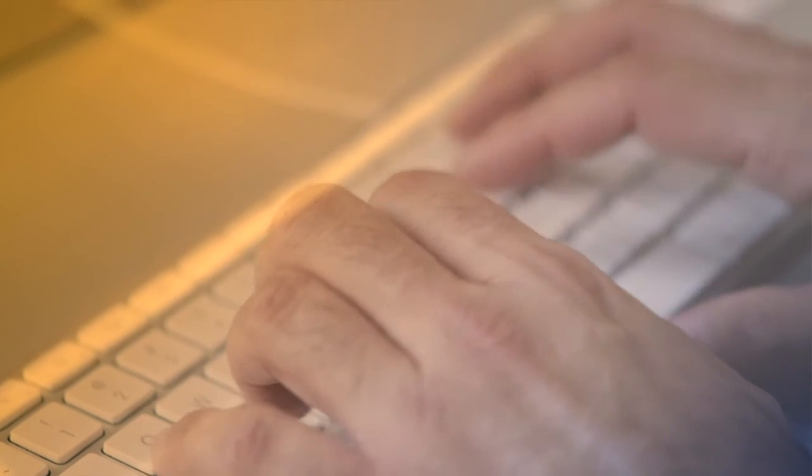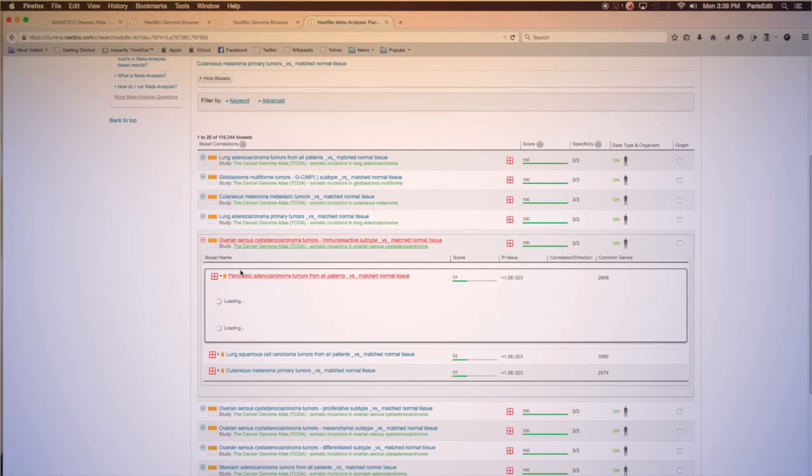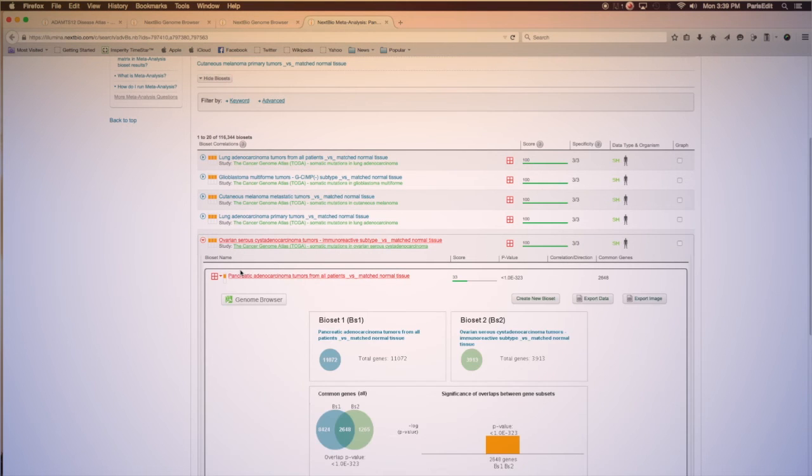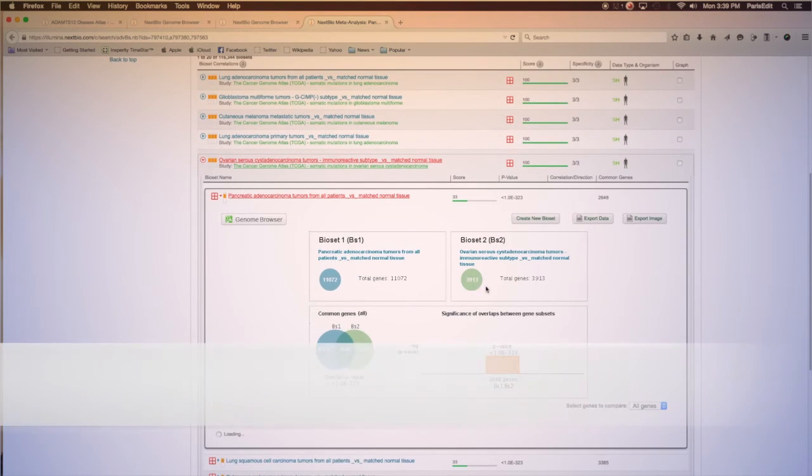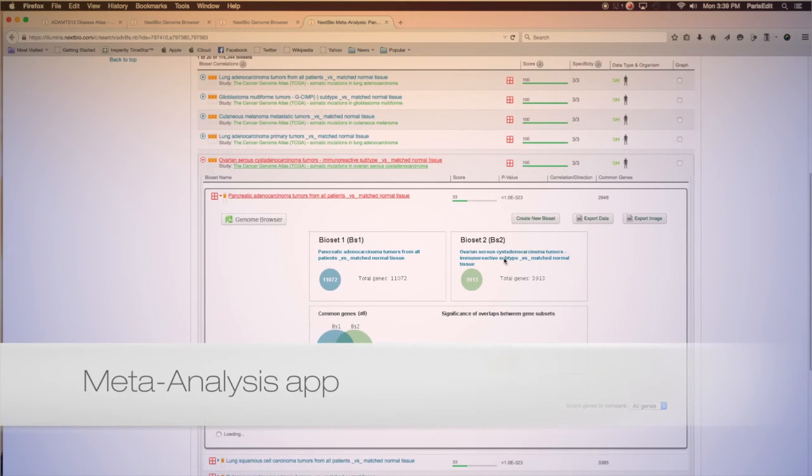Discover which genes are significantly regulated and common across up to 150 biosets of your choice with the Meta-Analysis app.